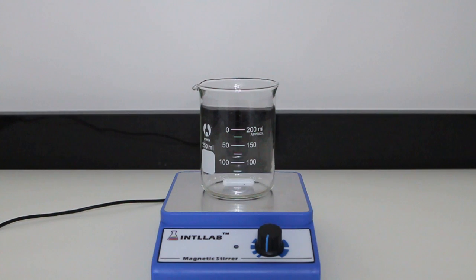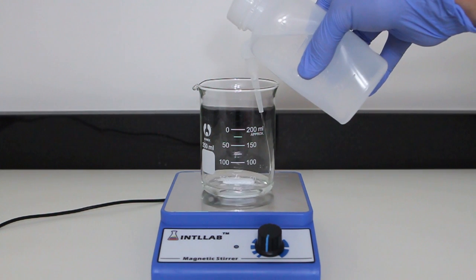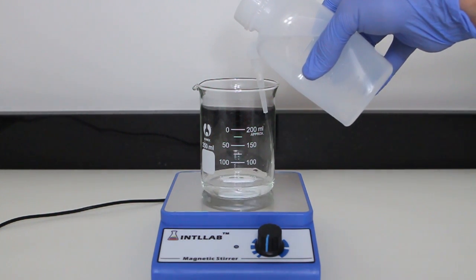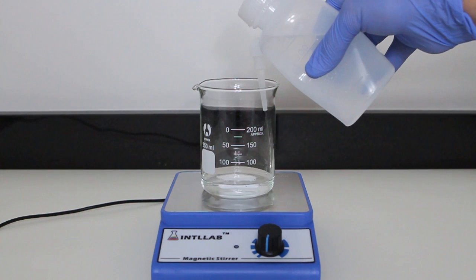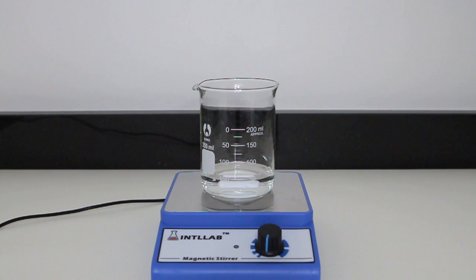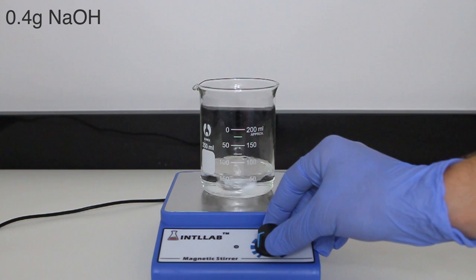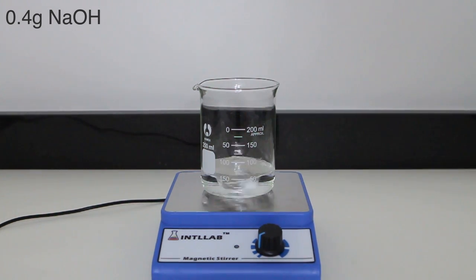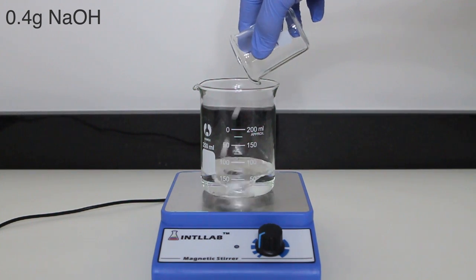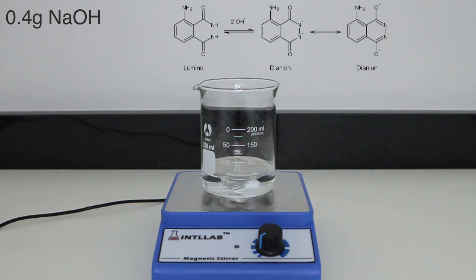To begin, a 200 milliliter beaker is set out on a stir plate and filled with about 50 milliliters of water. The exact amount of water is irrelevant since we are going to be diluting the solution to 100 milliliters after the luminol and base are added. The only important consideration is to not add 100 milliliters or more of water immediately. The purpose of the base is to react with the luminol to produce a dianion. Luminol, as is, is unable to dissolve in water, yet the dianion is.